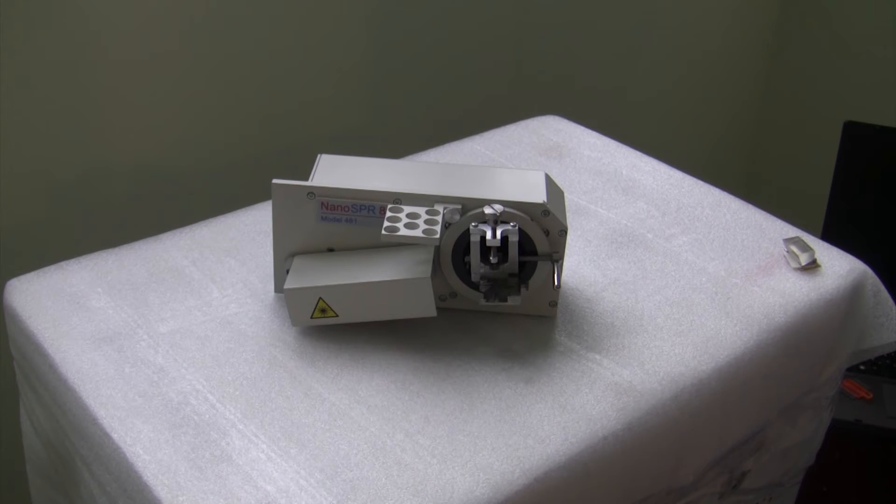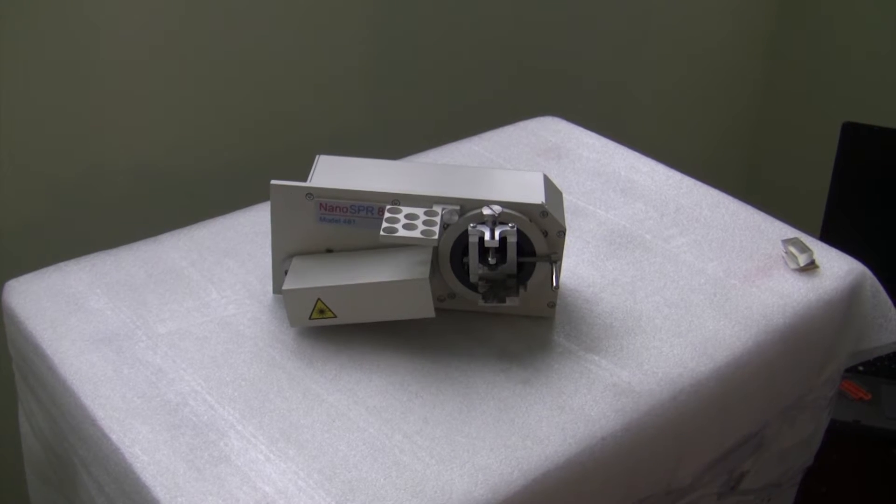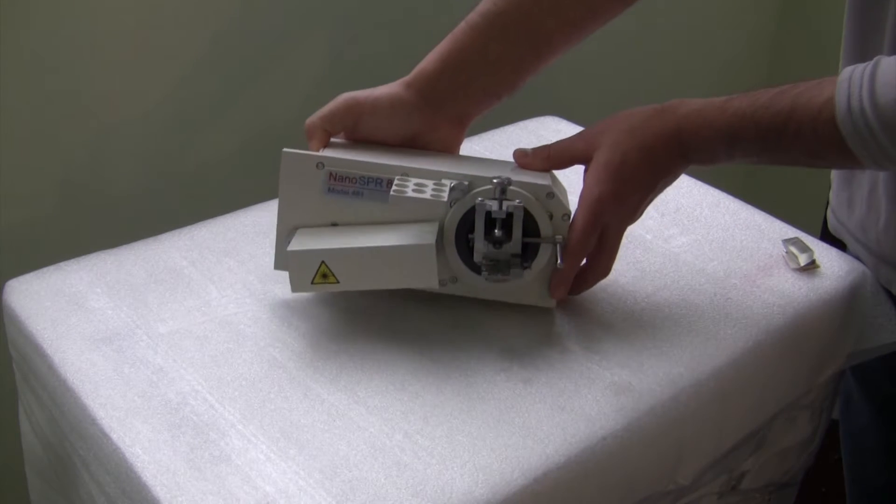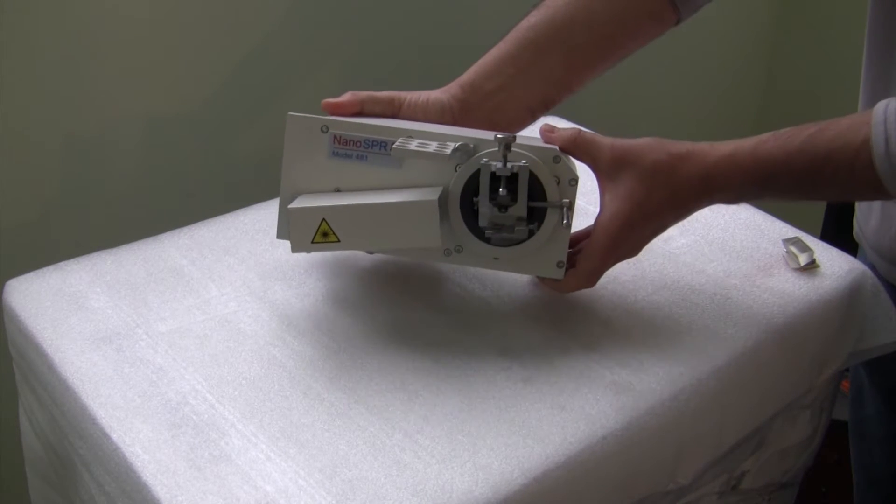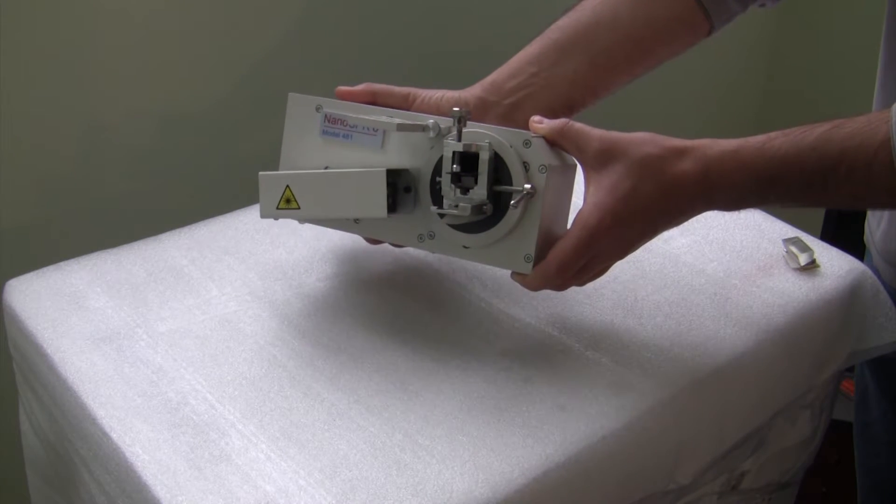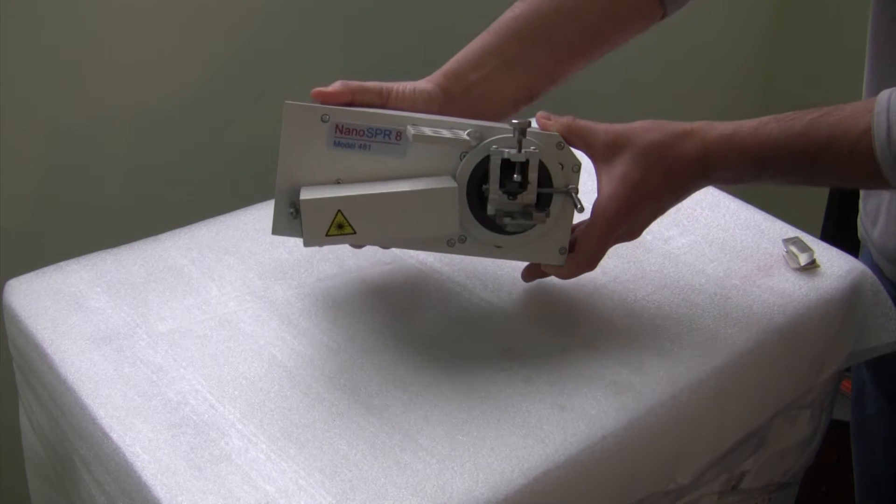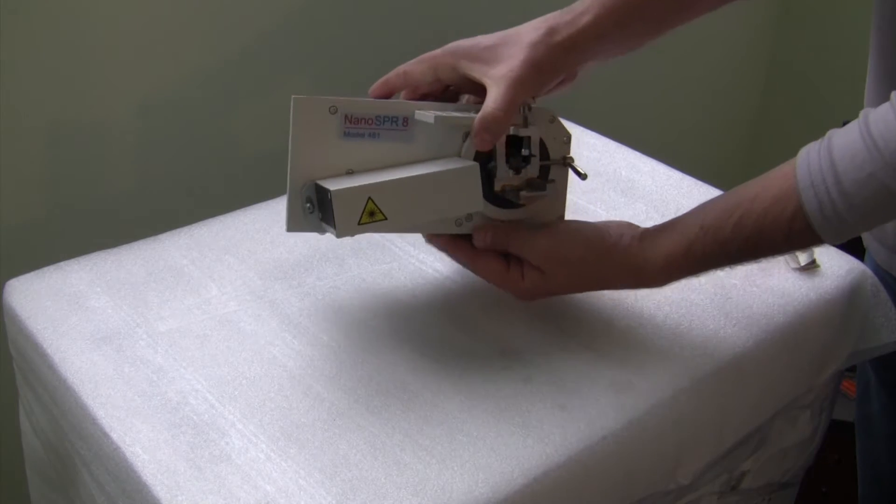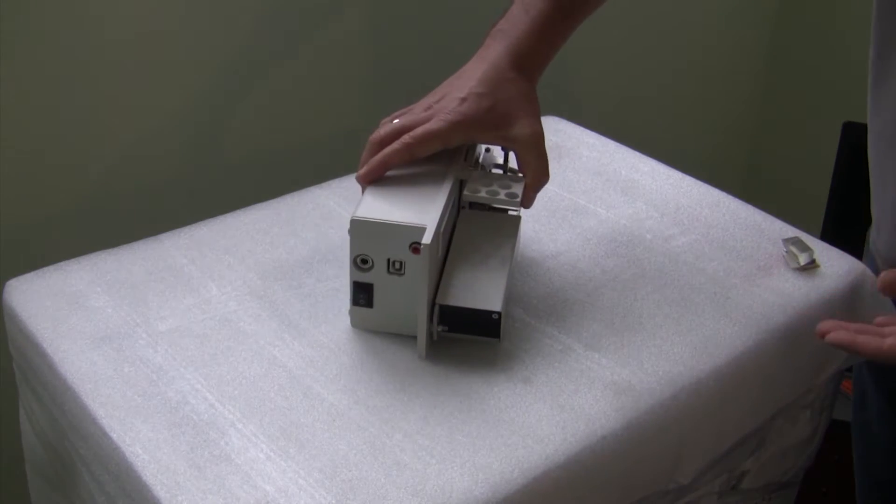Hi, my name is Yuri Chegel and I would like to present you NanoSPR 8 481 Surface Plasma Resonance Biosensor System. The device features compact size, 8-channel measurements for elimination of the drift, measurements in liquid and air environments, and possibility of electrochemical measurements with external potentiostat.